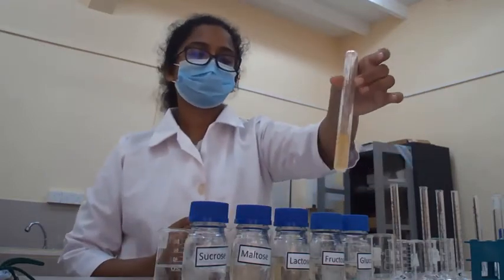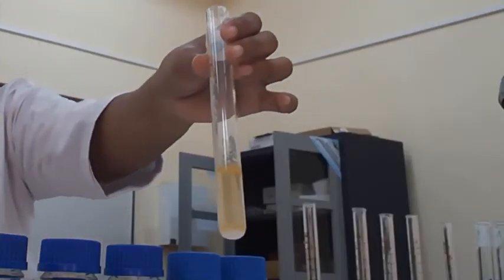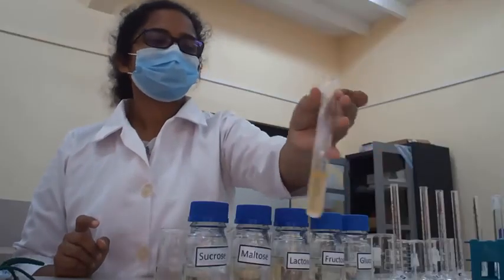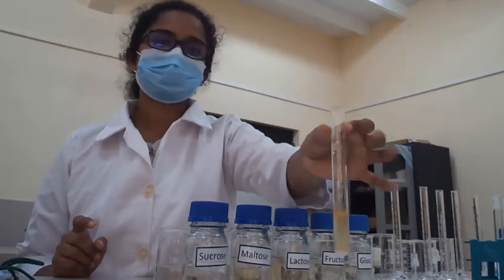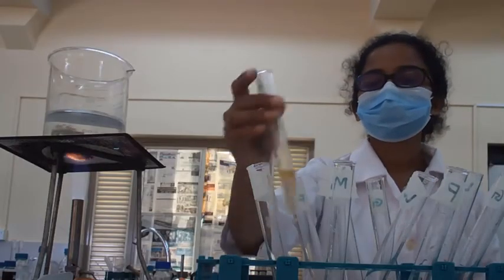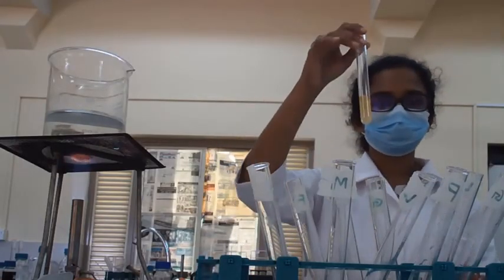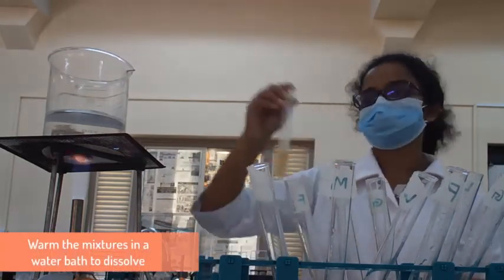We have added this sodium acetate and phenylhydrazine into the sugar solution. Likewise, we are going to add these two into our measured sugar solutions. Then we are going to place these prepared solutions in a water bath until they get dissolved. Okay?